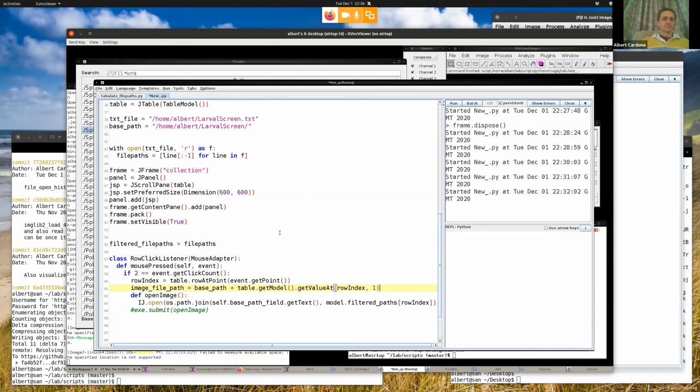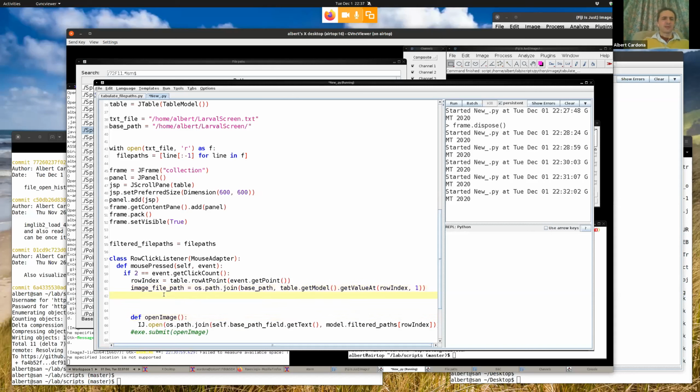If I do it this way, what's going to happen? In the first place, in Windows, it may not work well, and so on. It may also not merge these paths correctly. So instead, I'm going to use a library called os path join that will take the folder where the file is and then the file. And it doesn't matter that the file is a file that has folders in it. This will do the right thing. This will join the base path and the relative path together appropriately in an operating system manner. And so then once I have this, what else do you want to do?